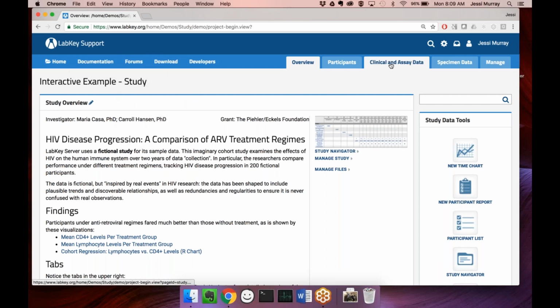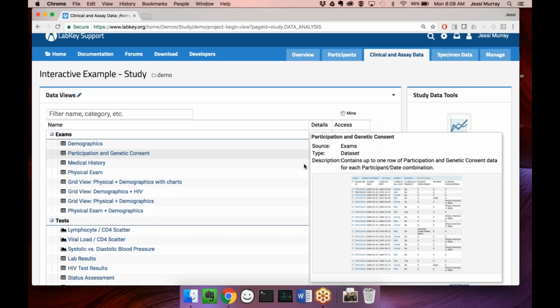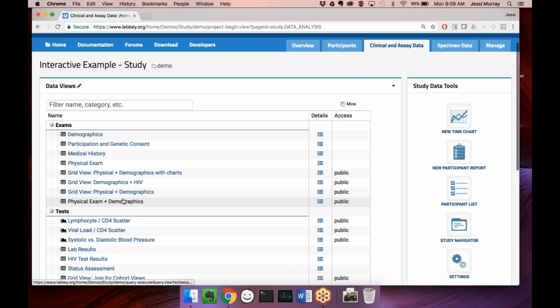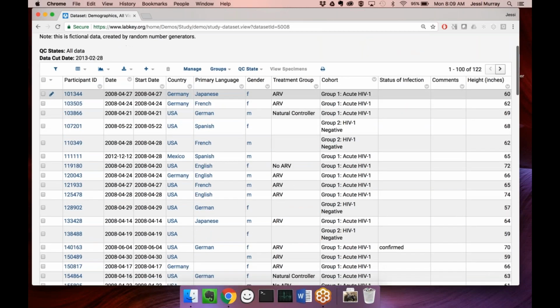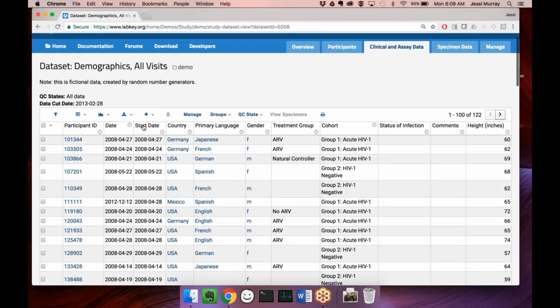Some other content we changed. One of the areas that we focused on in particular was the grid as well. This may seem hopefully at least similar to you, but I can point out some particular changes.